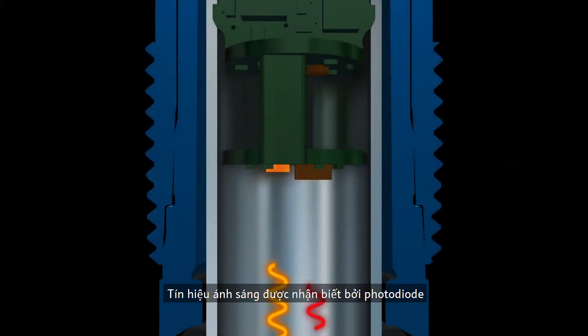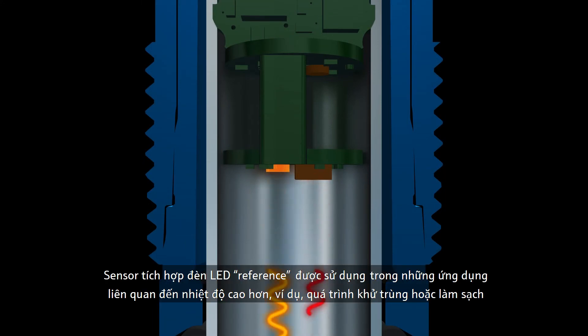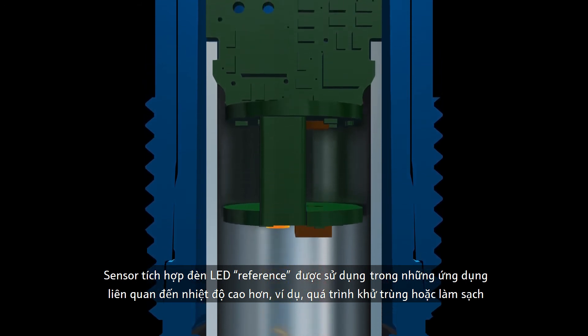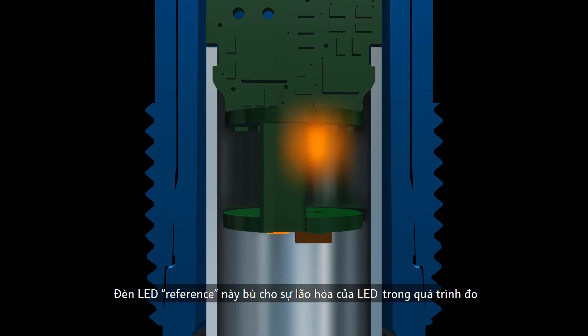In applications that involve higher temperatures, for example during sterilization or cleaning, sensors with reference LEDs are used. This LED compensates for the aging of the measurement LED and delivers reliable results even in demanding applications.